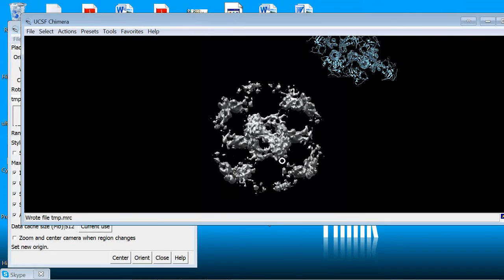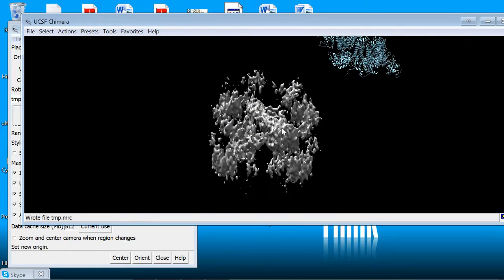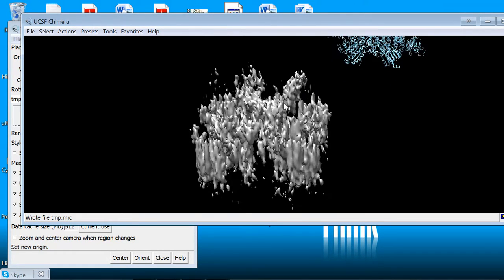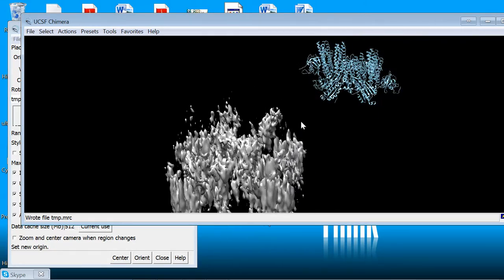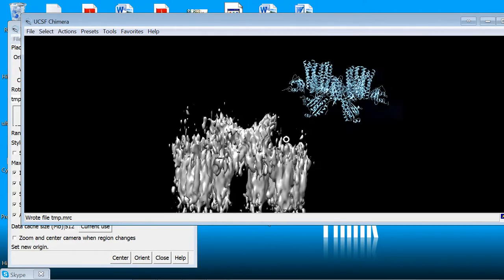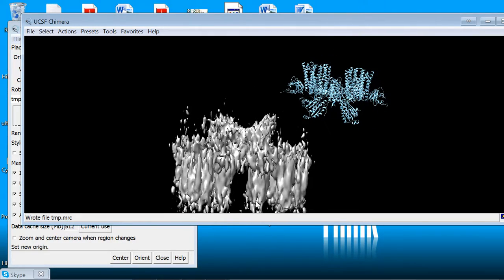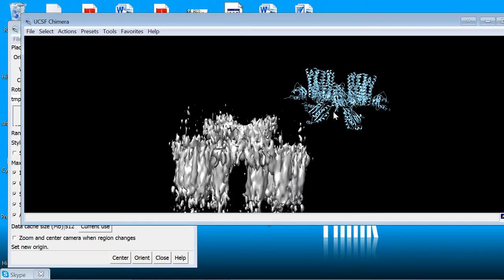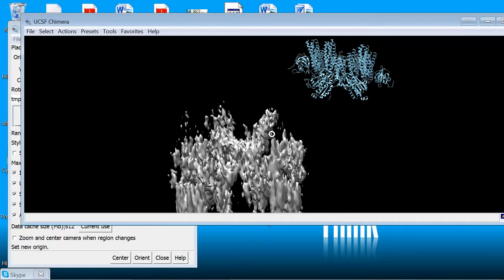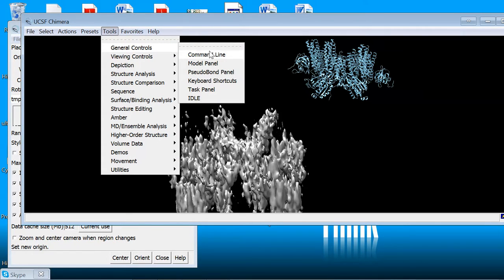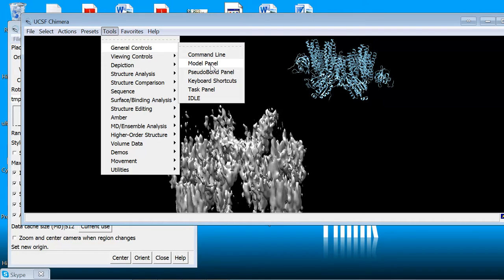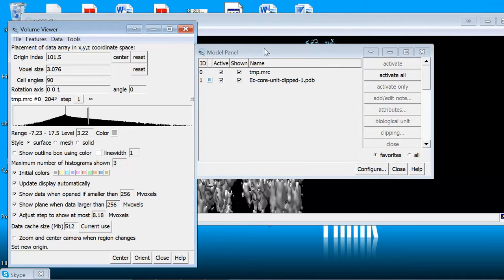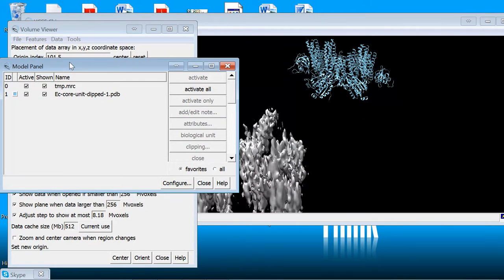So now we've got our map and our model. And I don't know if this is obvious to you but the receptors are pointing down in this view in the map and up here in the model. So the next thing we're going to do is open the model panel which allows you to select different things. So if you go to tools, general controls, and model panel it will open up the model panel.